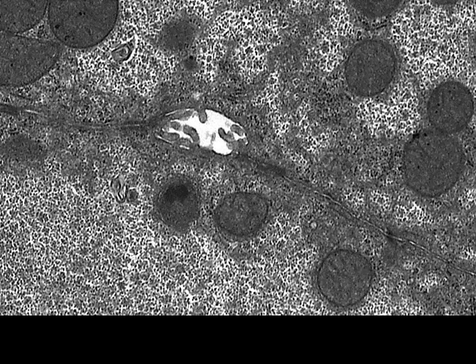Here we have a closer view looking at the bile canaliculus. We can again see that it is also filled with microvilli. And then we can see our fascia occludens junctions between these 2 adjacent hepatocytes. We can see the very tight junctional complex is just adjacent to the canaliculus, but this is also going to run along the boundary of these 2 cells, sealing them very tightly along their lateral borders.